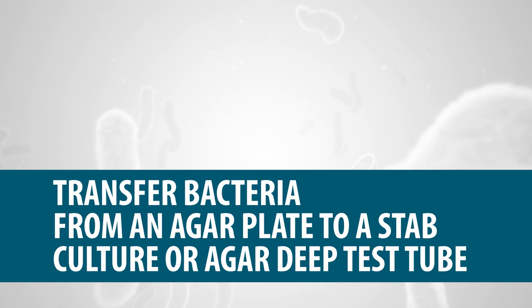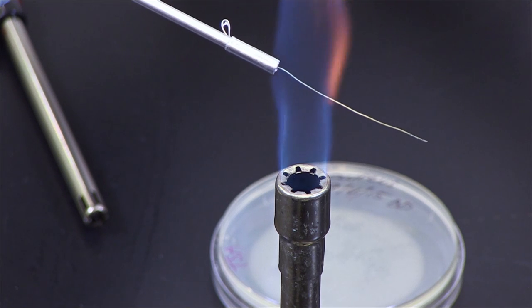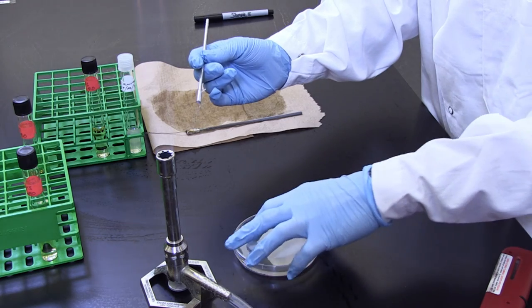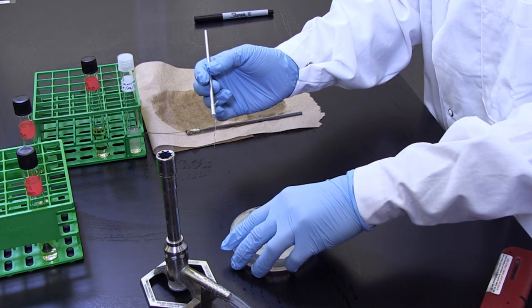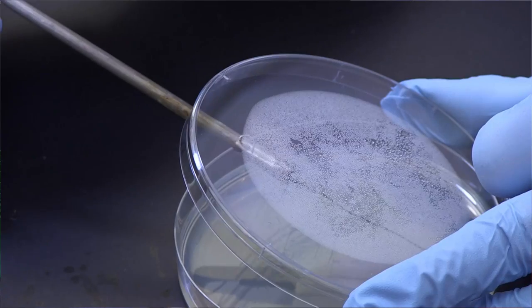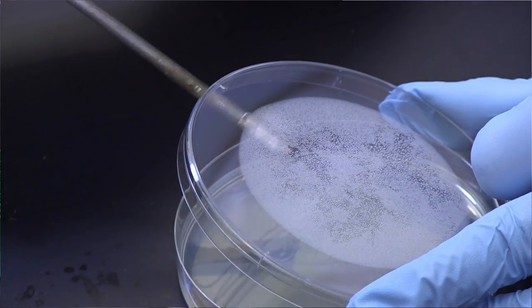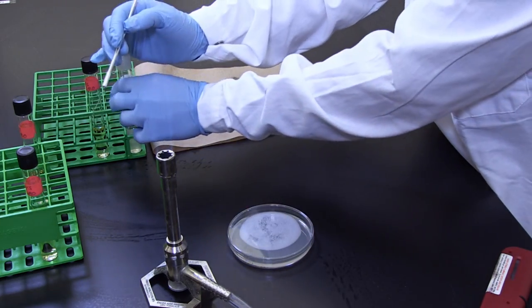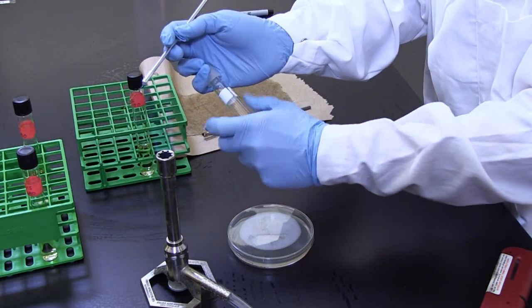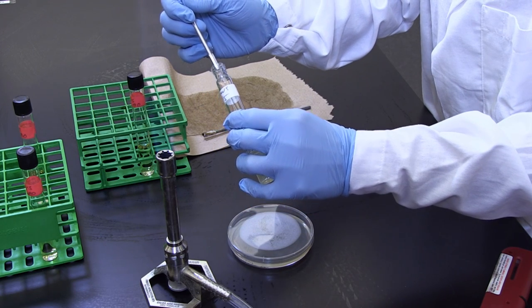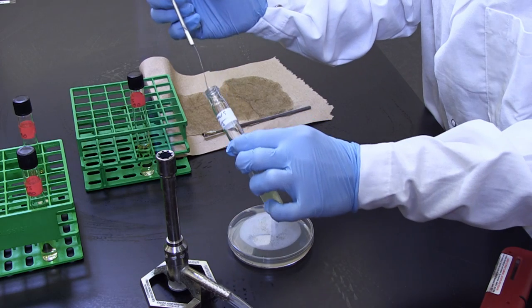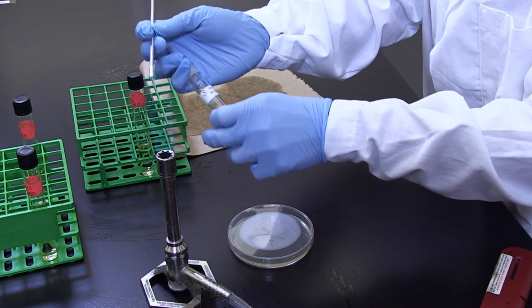Transfer Bacteria from an Agar Plate to a Stab Culture or Agar Deep Test Tube. Sterilize the inoculating needle and allow it to cool for 10 seconds. Lift the lid of the agar plate at a 45-degree angle with your free hand and hold it over the base as a shield to prevent airborne contaminants. Gently rub the needle over a single colony. Stab two-thirds of the agar with the needle two to three times in the center to transfer the bacteria to the agar deep. Use the aseptic technique to remove and replace the lid of the agar deep test tube.